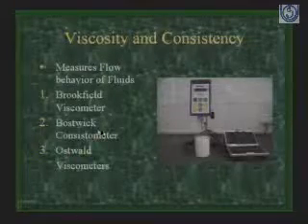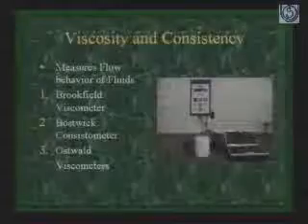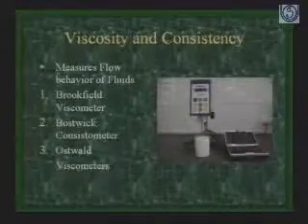So there is a channel and there is a cuvette. We put the product in the channel, in the cuvette, and there is a trigger. We fill the product and then allow it to flow for up to 30 seconds, and then we measure how much, in cm, it flows, and that is the international standard.